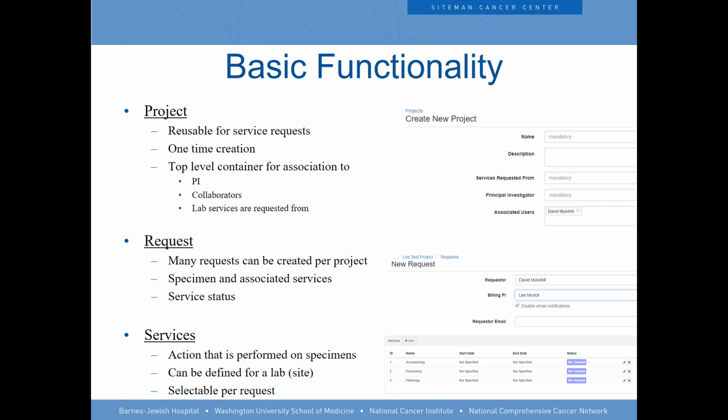Right. So Donna, what we allow people to do is attach a CSV file along with the request, saying that these are the 100 specimens that we need, and then therefore the lab has to now take care of creating those specimens in OpenSpecimen and then processing them. So while the request can have specimens that are not in OpenSpecimen, for the request to be processed and completed, the lab staff have to first create those specimens in OpenSpecimen.